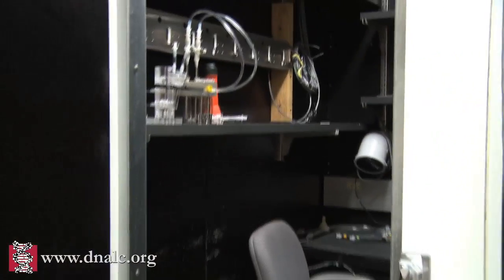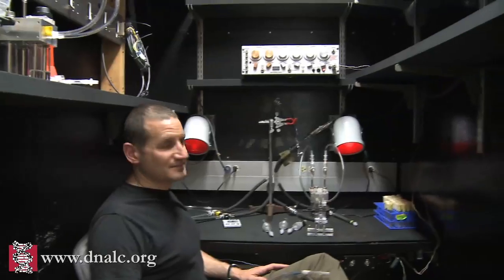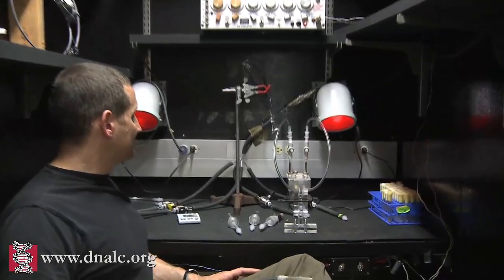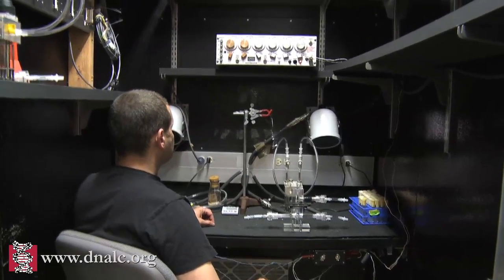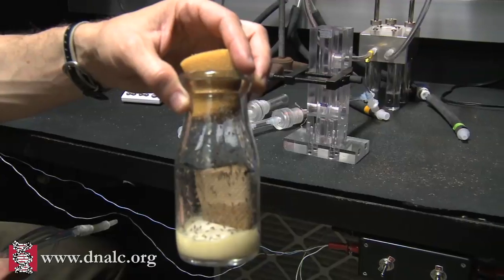Let's go into the lab and watch fruit flies learn about odors. This is the fly room where we train the flies, and we sit in this dark, humid, warm-temperatured room and do our behavior for hours on end.